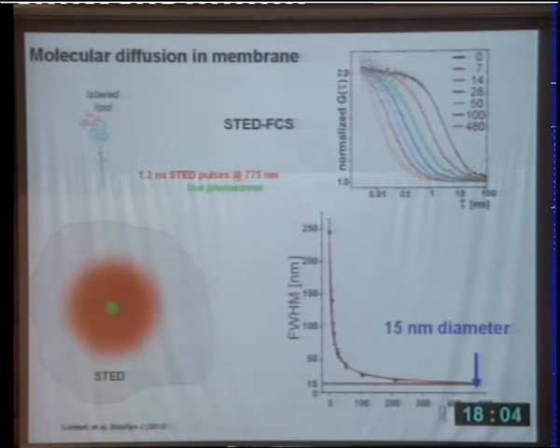And for those of you interested in that area of application, the question is how small can you make that scale? In recent applications, we show that in artificial membranes, you get down to 15 nanometers in diameter. In live cell membranes, something like 20 nanometers. And this is, of course, quite a lot if you compare it to the diffraction resolution or the barriers set by the confocal microscope of about 250 nanometers.